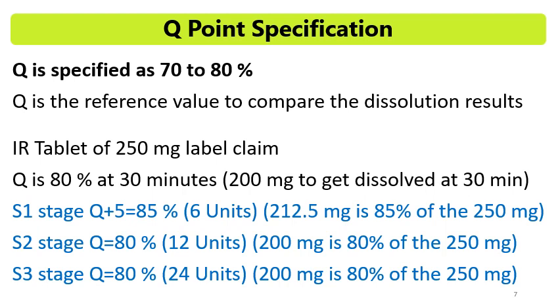There is no upper limit for the dissolution, only a lower limit is given, and as per my consideration and my understanding, the lower limit of 80% is given so that the formulation is not holding the API for a longer time, and the formulation is releasing the API above 80% if it is a type of IR formulation.